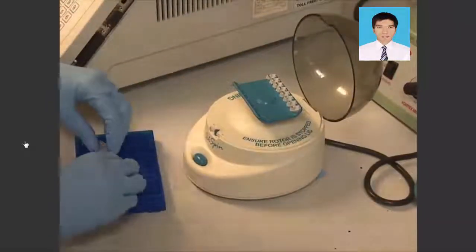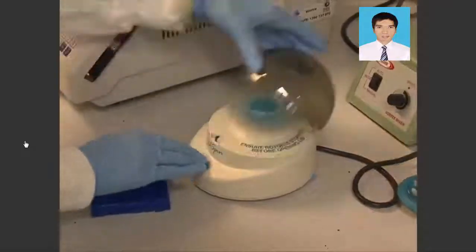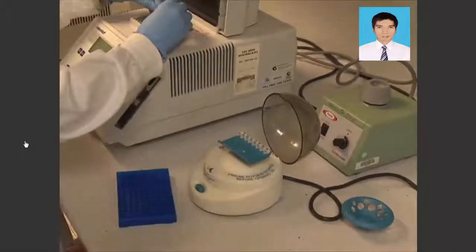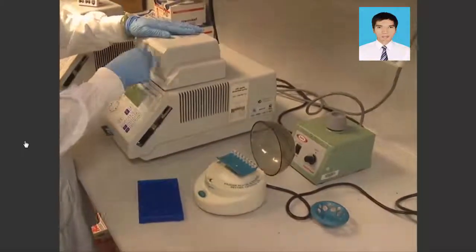In a temperature gradient thermocycler, set the run reaction in a gradient plus or minus 3 degrees Celsius from the predicted Tm of the primer across 8 to 10 tubes. Vortex the tubes and spin briefly in a microcentrifuge prior to placing them in the thermocycler.